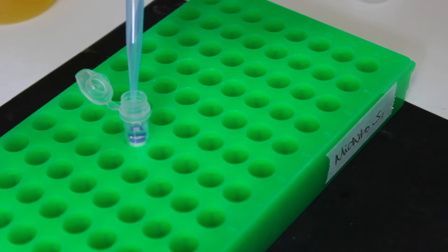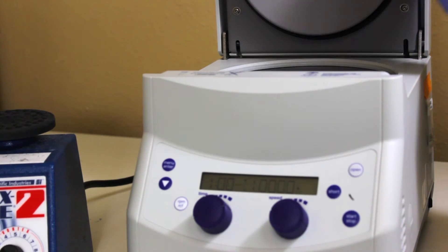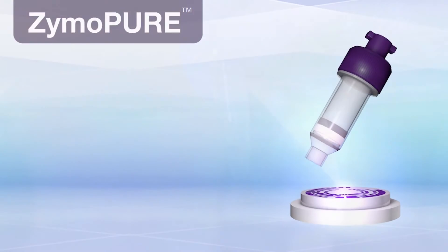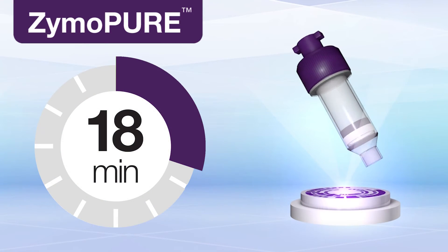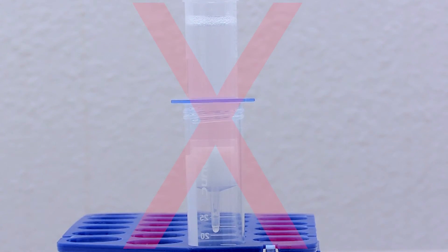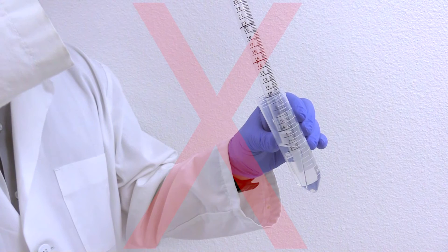Wash and elute your transfection-ready plasmid DNA directly from the column using a microcentrifuge. The entire procedure takes less than 18 minutes and there is no need for slow gravity flow anion exchange columns or time-consuming alcohol precipitation steps.